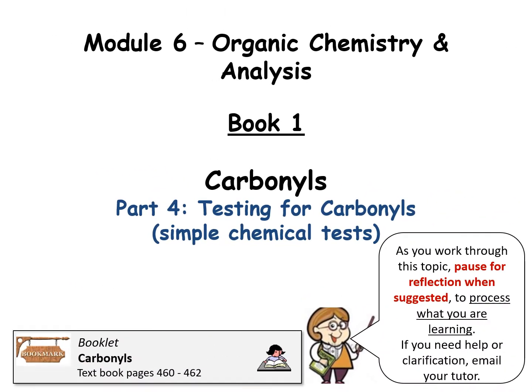Welcome to the fourth and the last PowerPoint for the carbonyls topic. Here we're going to look at how you test for carbonyl compounds. The textbook page references are 460 to 462. And as usual, as you work through the PowerPoint, make sure you do pause for reflection when suggested to process what you're learning. And if you need any help at all or clarification, do ask your tutor for that help.